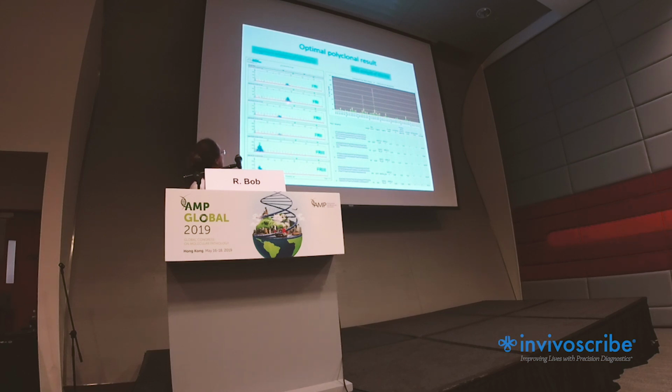They look like a line each here, in different frameworks, with fragment analysis and also with NGS analysis. You see many different sequences. Here each line shows a VH-JH segment combination, and each color is representative of one sequence. So you see we have a lot of sequences. There is also always a preferential segment selection.